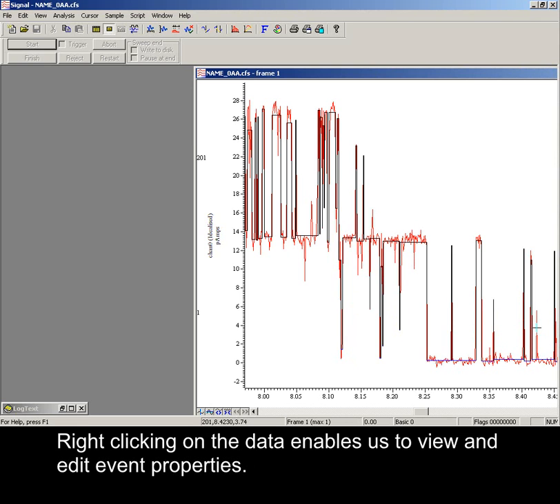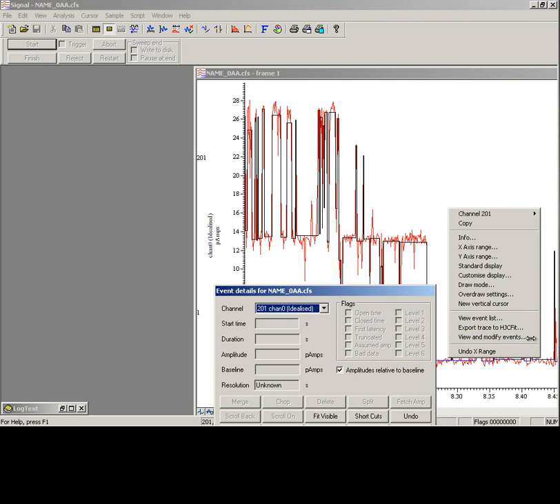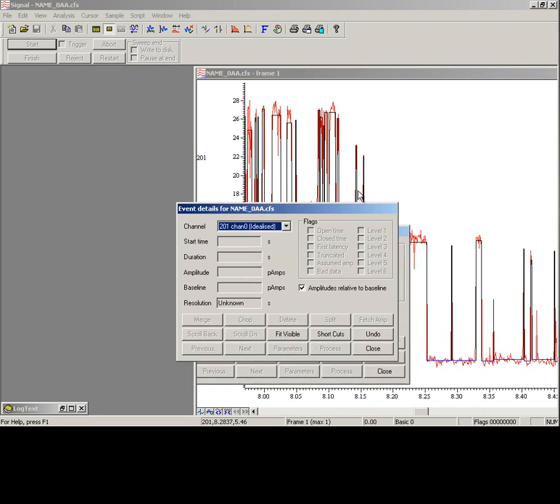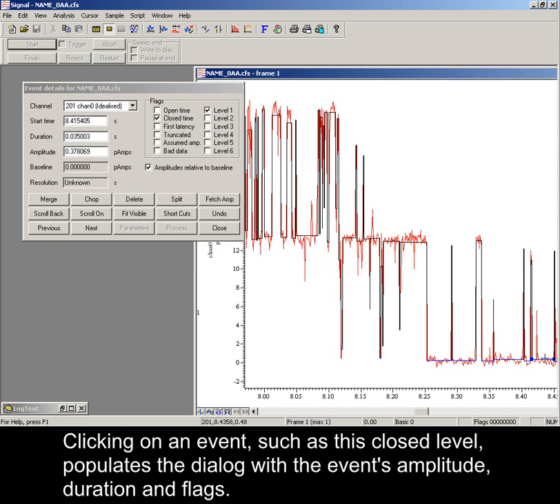Right-clicking on the data enables us to view and edit event properties. Clicking on an event, such as this closed level, populates the dialog with the event's amplitude, duration and flags.